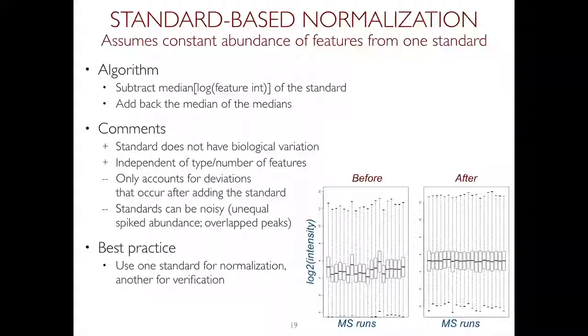Well, the way to think about this is that every normalization makes assumptions, right? And then you say, what are the least stringent assumptions that I can make in every case? So having proteins not changing, and those proteins may have multiple peptides and multiple fragments, is really a good way to go. If you don't have that, say I have an SRM experiment with 20 proteins and all of them are in this pathway, which is supposed to be affected, you don't want to do quantile normalization, right? So then you need some way of using an external normalization. If you can target a couple of proteins which are not changing, that's best. If not, spike in references to control for different digestion and so on steps.